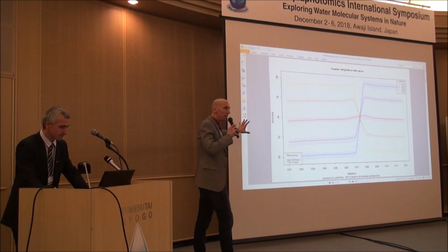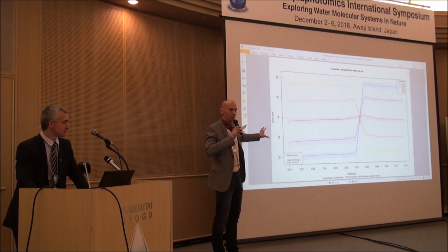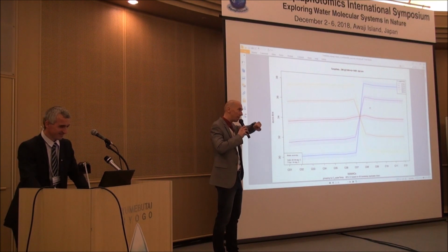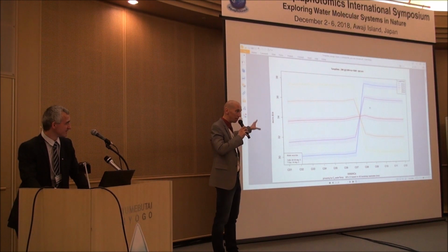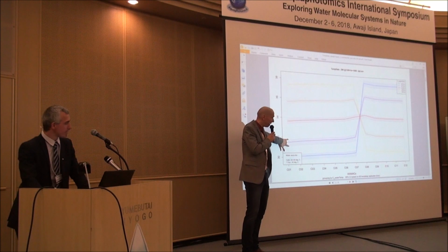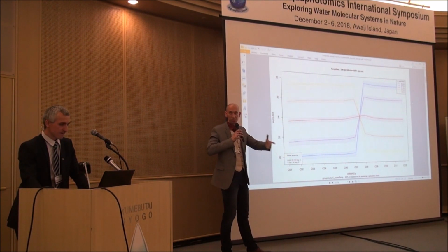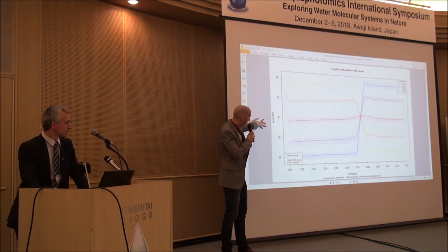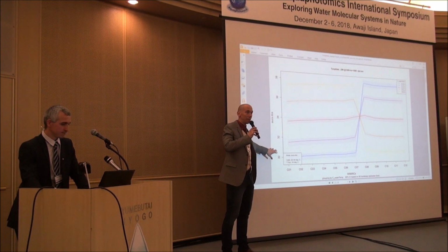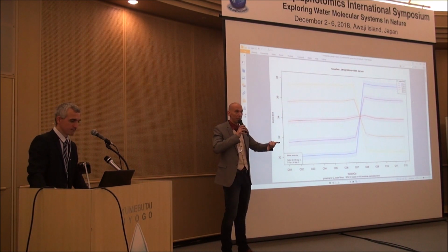Okay, so this I would say is something very important. The importance of this I cannot underline enough. So this actually is an aquagram, but not in a circular way, but in a linear way, which has many advantages. And you see here the shaded stuff, actually confidence intervals, because we implemented this method to calculate the aquagram based on the temperature calibration curve. This was the file that you copied before. This is the temperature calibration.